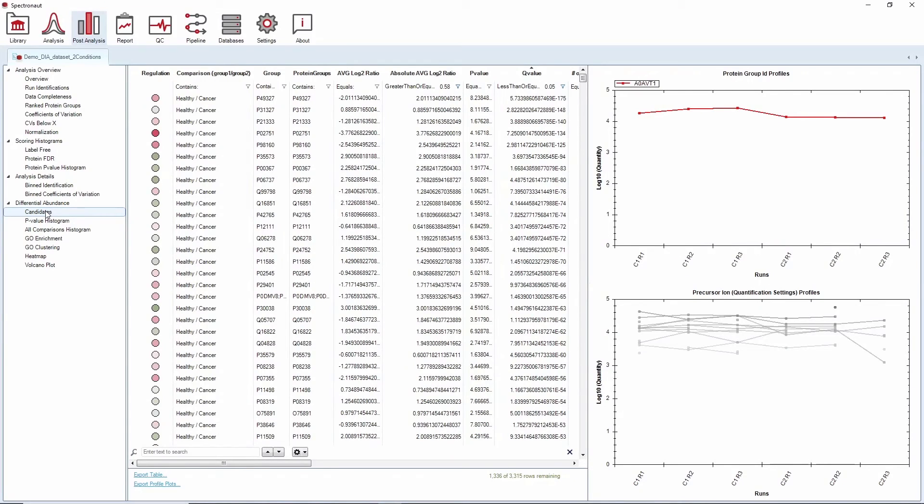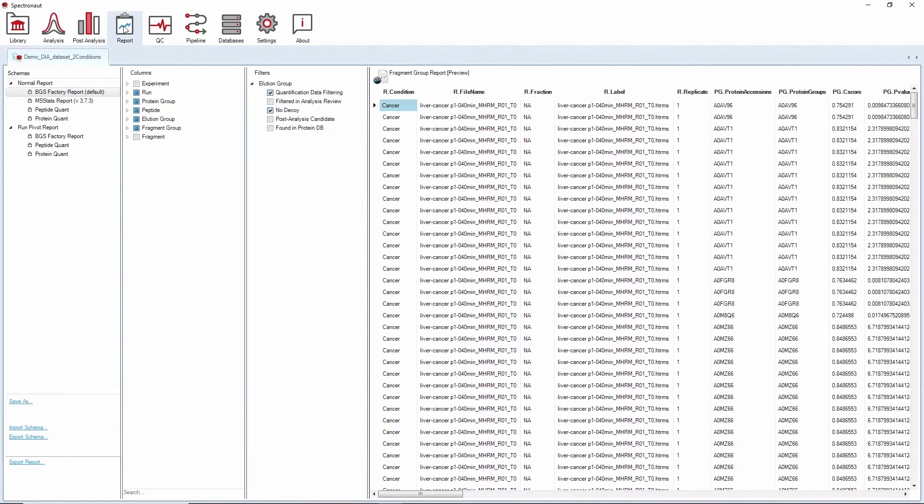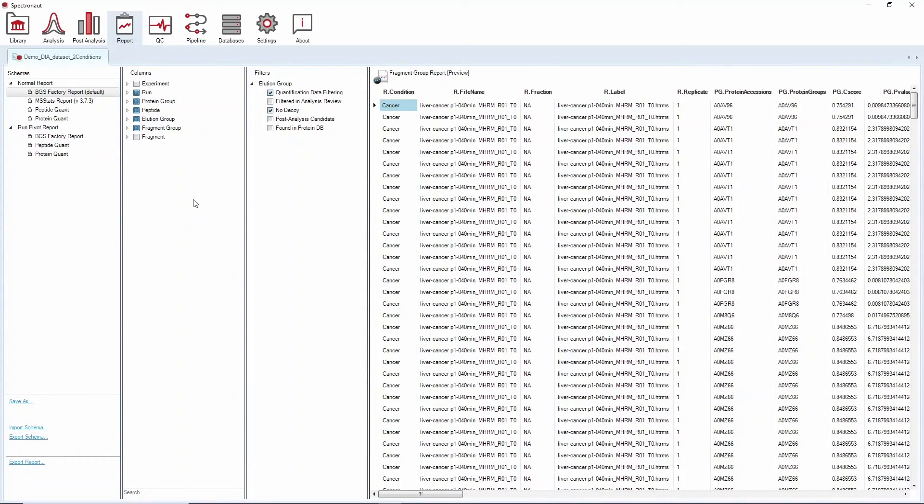If you'd rather export your results, you can go under the report perspective and customize the report that best suits your downstream applications.